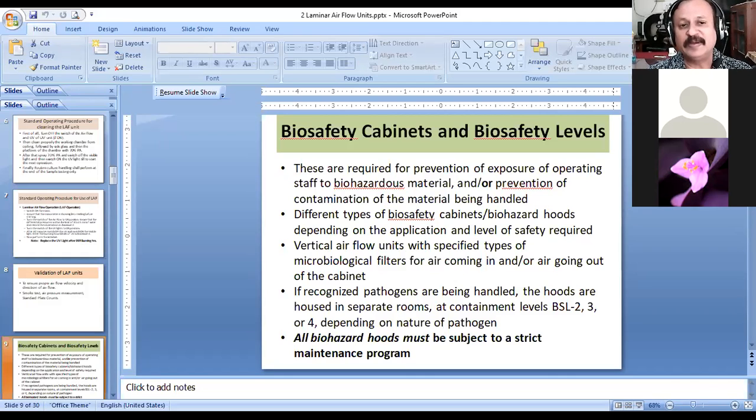Tyndall's apparatus is like a simple cabinet where you do not really have a laminar airflow, and you may also have a cabinet with a laminar airflow, depending upon your own way of working. But even if it doesn't have laminar airflow, it necessarily depends upon your good microbiological skills or techniques, where you are ensuring that you do not get contamination, or you are not going to spoil your own material, your media.